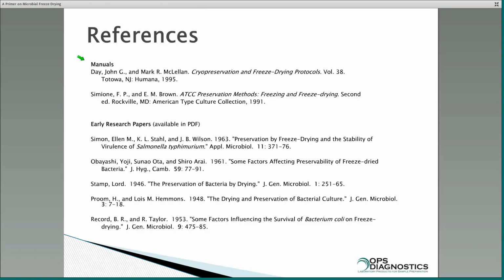Where you might have a problem is if you try to freeze dry a paste. I think that could be a real issue where you may not have enough lyoprotectant for the number of cells in there. But I know that just going from a standard culture concentration to the same concentration using the lyoprotectant, you're usually in pretty good shape.